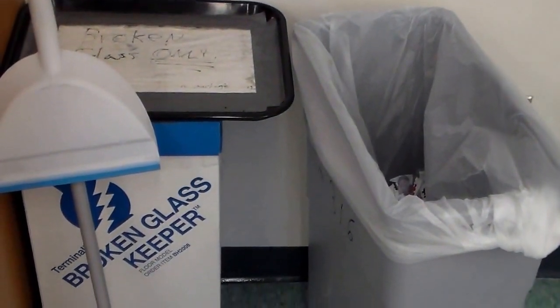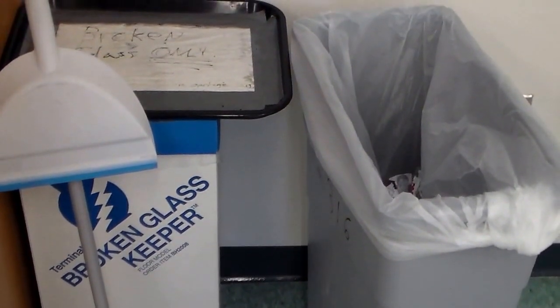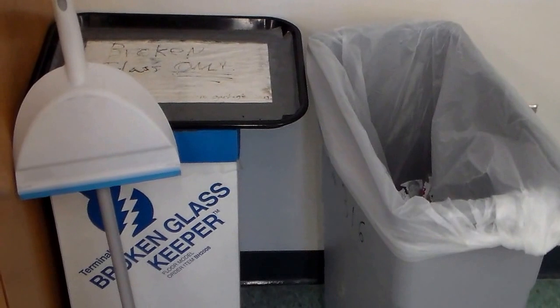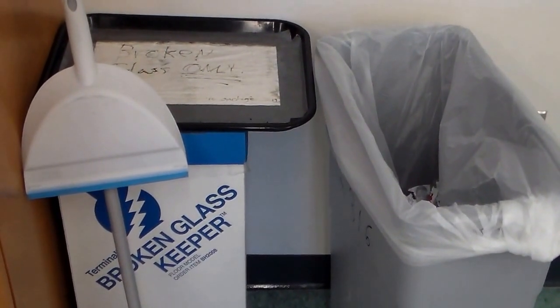Over here we have the broken glassware container. Only broken glass should go into that container. If it has any mercury it can't go in there. I don't think we have any in the lab, but if you ever see shiny silver liquid metal, make sure you talk to the faculty before it goes in.